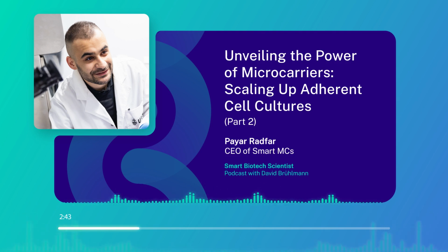And it doesn't take that long. It's more the patience. And obviously scientists are very busy, so they're busy with other things and they just want to jump steps, and it costs you in the long run. So that's the very first step. So what I'm hearing is it's important to be patient, take every step and do it completely instead of skipping steps, jumping too far ahead and then having to go back. Start small scale, very small. You don't need to start with a liter bioreactor at all.